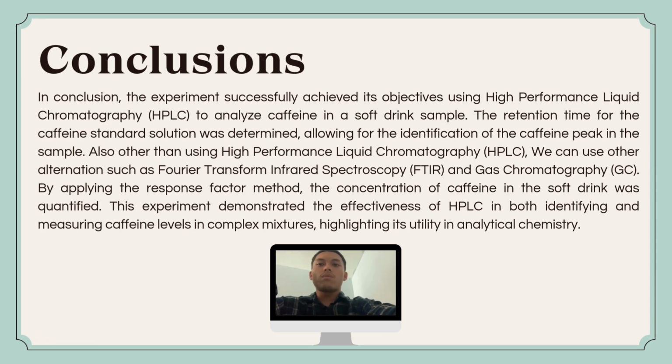This experiment demonstrated the effectiveness of HPLC in both identifying and measuring caffeine levels in complex mixtures, highlighting its utility in analytical chemistry. That's all from us.